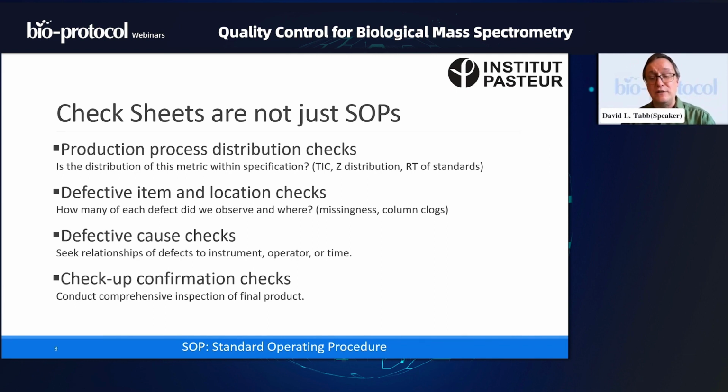Sometimes, however, our defects are much more visible. Something like a column clog could result in an experiment being improperly truncated. These things are supposed to last like an hour of shallow gradient on an LC-MS/MS experiment. It might be that the last 15 minutes are gone simply because the column blocked up and you got no more signal for the rest of the experiment. You would want to know if that happens. And particularly, you would like to know, where did this problem take place so you can prevent it from affecting further experiments.